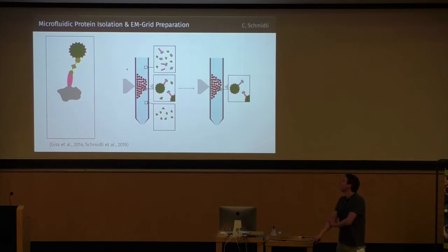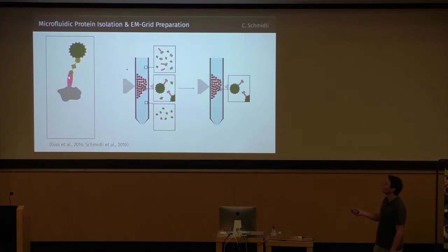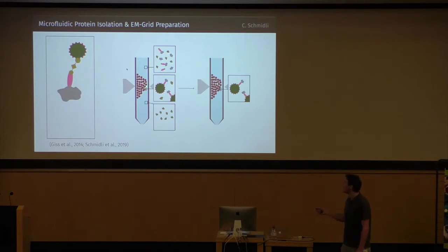The function is as follows. Your target protein is bound by a Fab fragment, and this Fab fragment is connected to a superparamagnetic nanoparticle by a photocleavable crosslinker. If you now want to fish a protein, first you create a plug of the beads within the capillary in the trap, and then flush over a mixture of proteins, which contains your target protein, obviously, which was pre-incubated with Fab fragments and crosslinker. Your target protein will then bind to those beads, be immobilized here in the trap, and all the rest is flushed away.